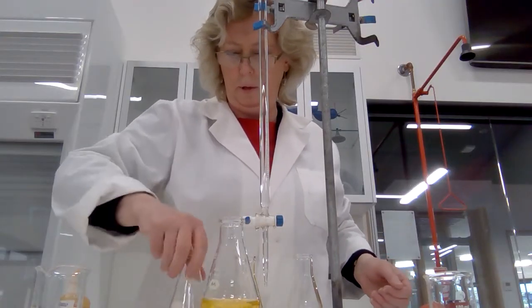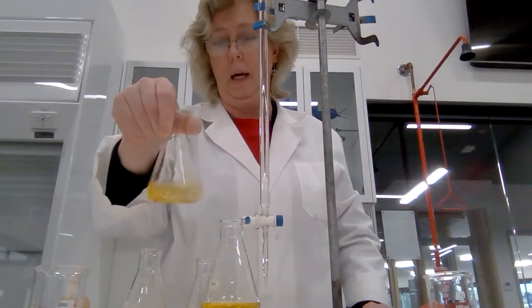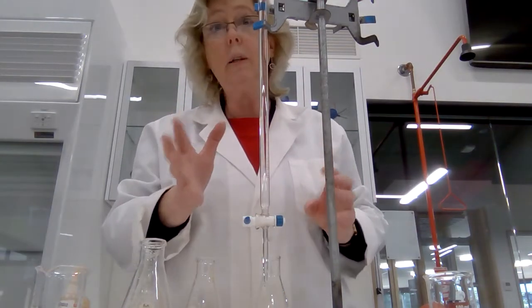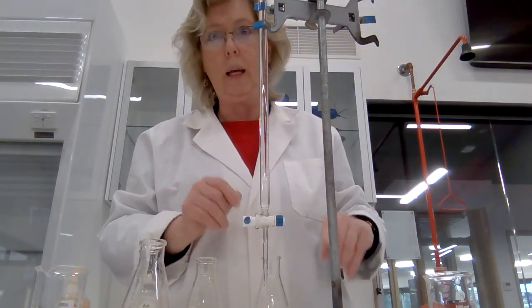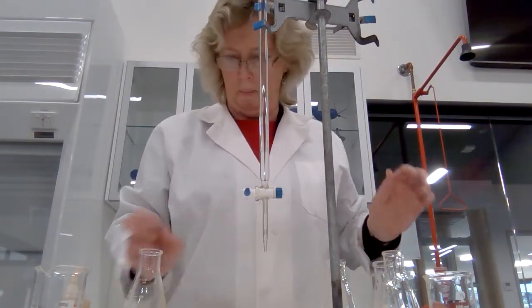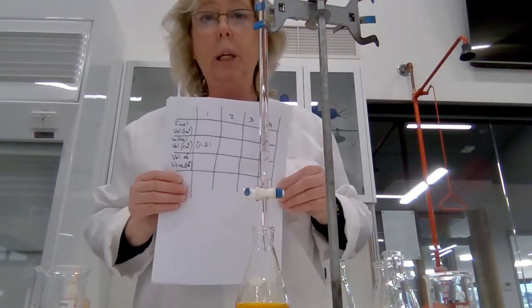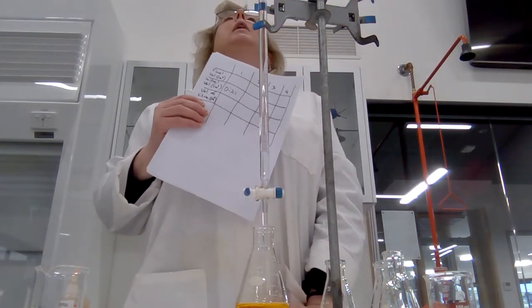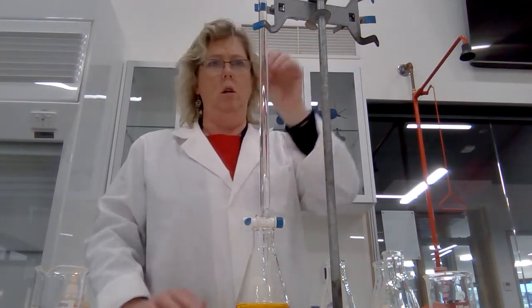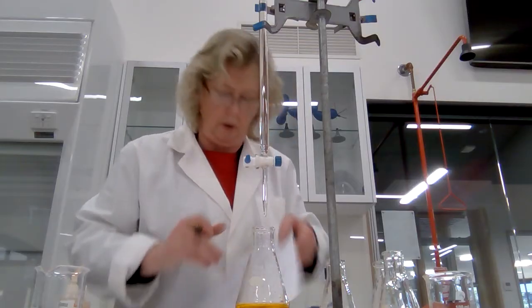Always give the flask a swirl. This is one of the reasons why we use a conical flask — because you can hold the top, swirl, and nothing will come out. My burette has got the hydrochloric acid solution in it, approximately 0.1 molar. We're actually trying to find out what the accurate concentration is. I'm going to record my results as I go. My first volume — let me check — it must have been dripping, it is actually 0.40.